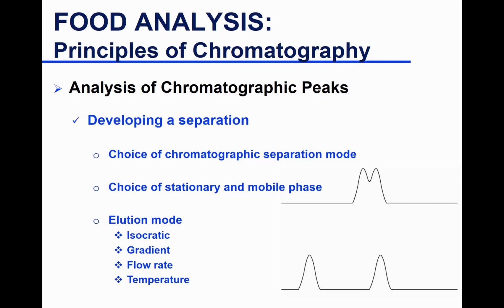So in chromatography, we play around with the mobile phase composition, flow rate, and temperature to enhance separation between two peaks. Next week in lab, we'll talk about that when you do the caffeine lab, and I'll show you examples of what we can do.